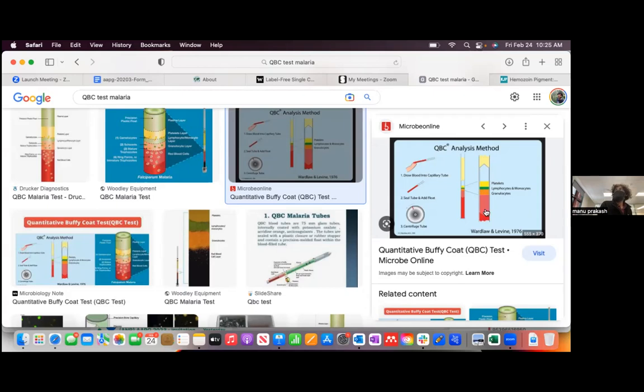And then you just choose the density of this specific little bobbing piece inside the capillary, and that determines which zone you want to stretch and get higher resolution at. And so I think one of the threads, this is the exact reason why you can use something like this to even determine every one of the sets of species associated with this.